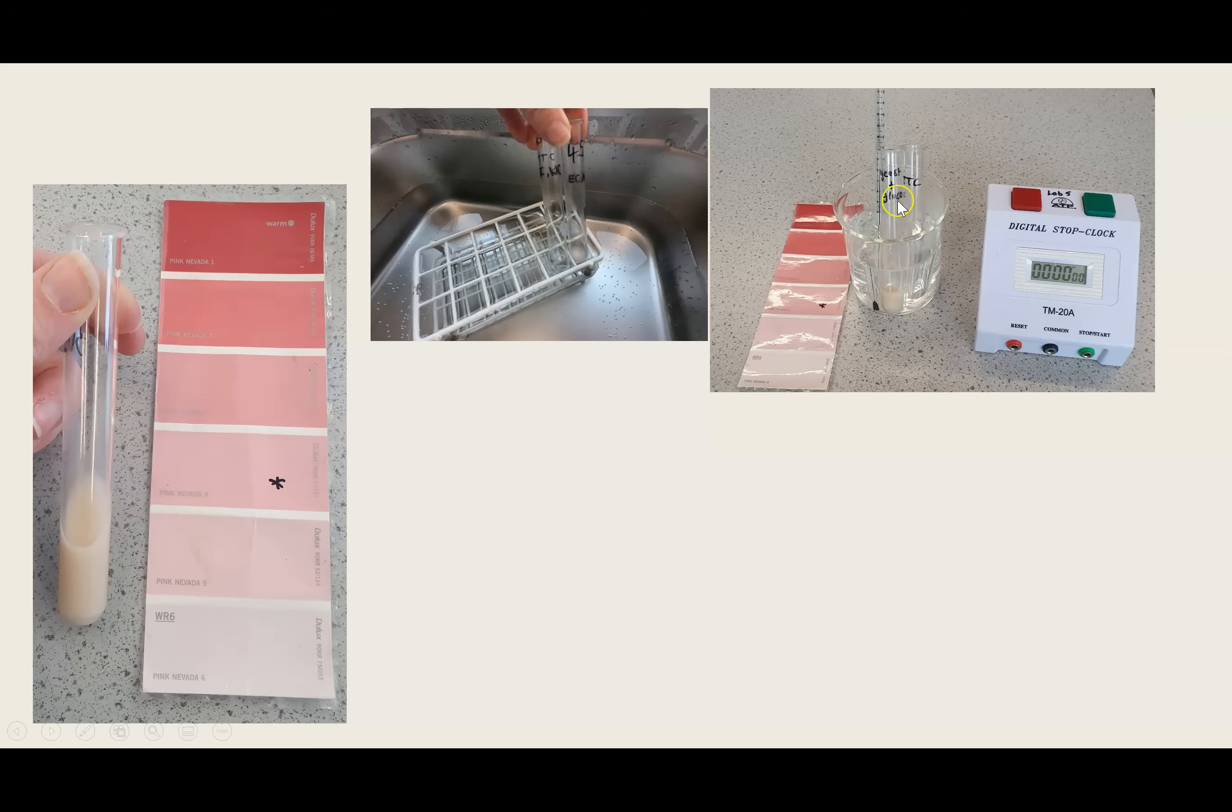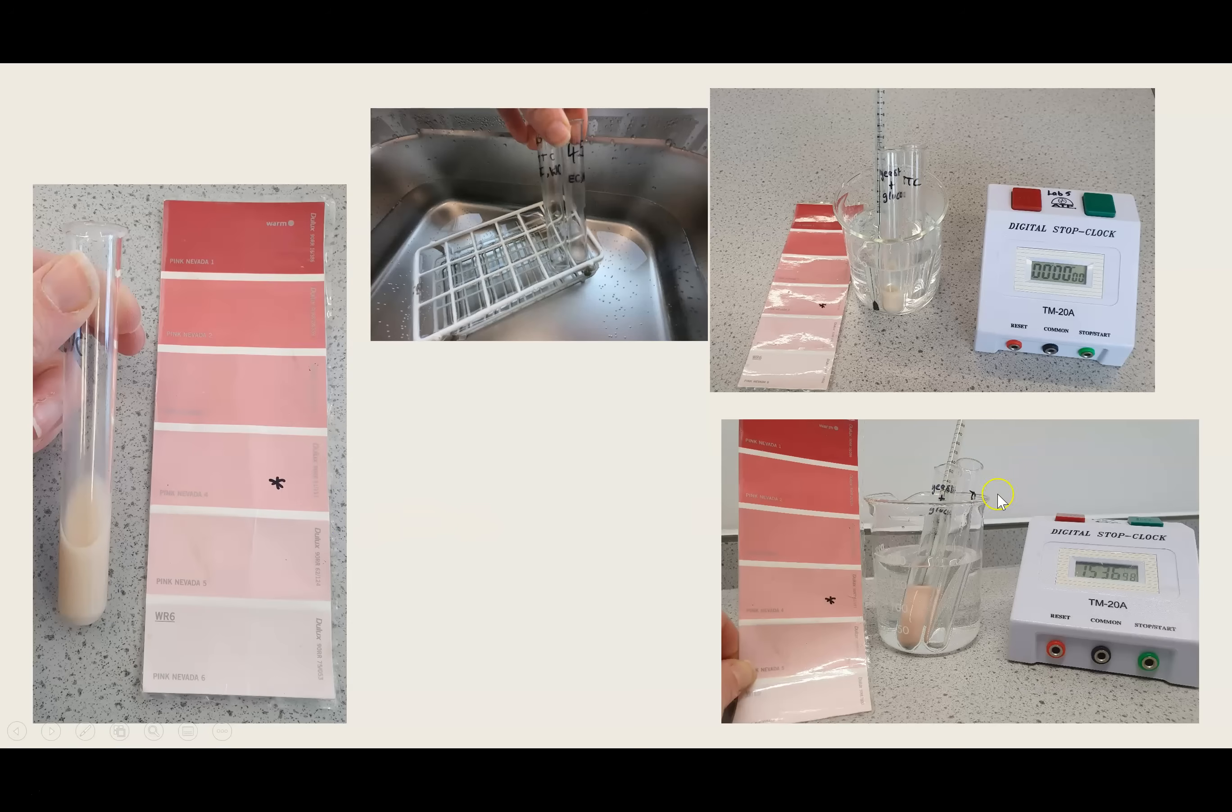At this stage, I've mixed together the yeast and glucose solution with the TTC, and I've quickly taken it out of the water bath just to show you that at the beginning, there isn't actually any pink at all. It doesn't match any of those colors. I'll then start the stopwatch as soon as I've mixed them together.